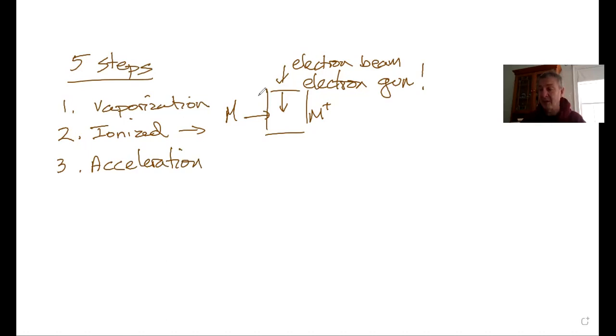Now, what you do is you accelerate it down a vacuum tube. Obviously, to the extent you can create a vacuum is perfect, because you don't want your particles flying down there and being slowed or deflected or diffracted or interfered with by particles in there, oxygens or carbon dioxides or waters or whatever is in there. You don't want that interfering. So it accelerates down a vacuum tube.